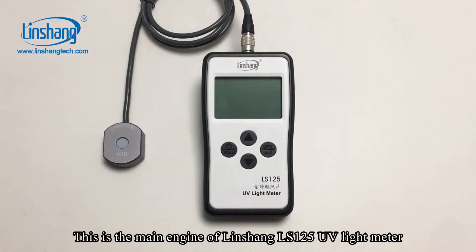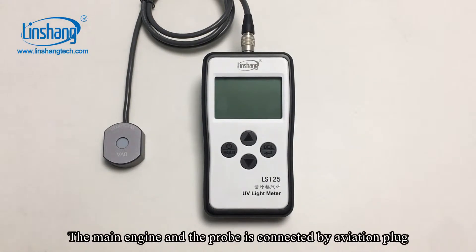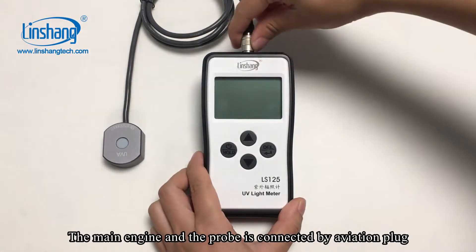This is the main engine of Linshang LS125 UV light meter. The main engine and the probe are connected by an aviation plug.